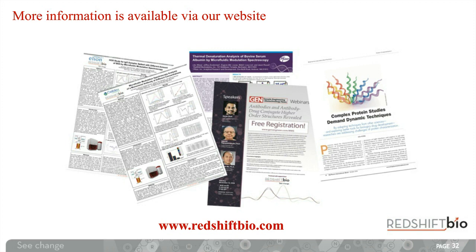All right. And perhaps I could just add. Sure. Sorry, Patrick. That's okay. Perhaps just to add, our specifications are based on a lysozyme protein, to give you a reference.